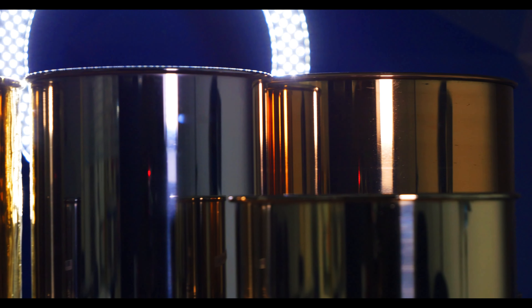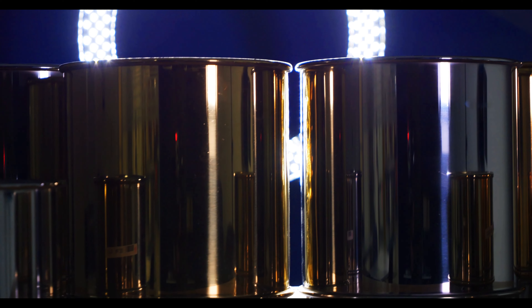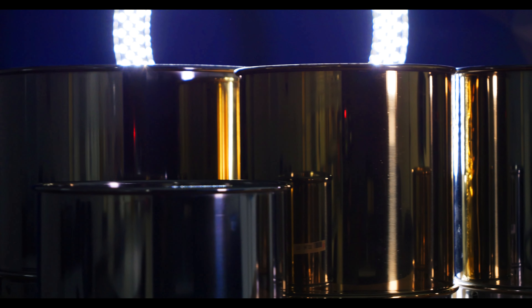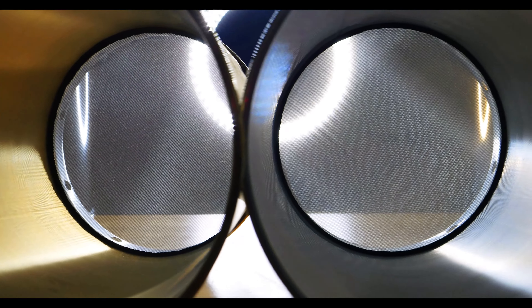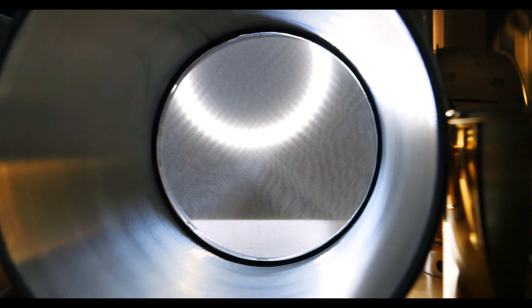For example, wet wash sieving is used quite a bit in the aggregate industry. Clay and silt stick to the outside of the rocks, which makes them unable to pass through the mesh. By adding water to the sieving process, the dirt and silt are cleaned off the outside of the rocks, allowing them to be measured properly. I should also note that deep frame sieves aren't used with the wet test kit — lab technicians typically hold them, put their sample material in, and perform a hand sieve analysis to mimic the functions of the RO-TAP wet test sieve kit.